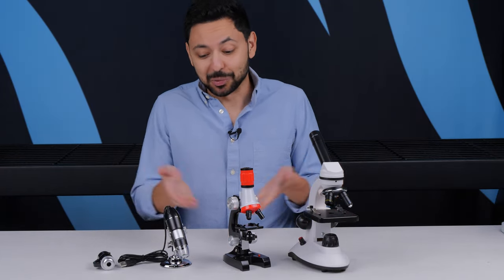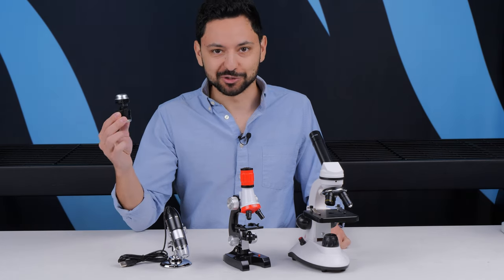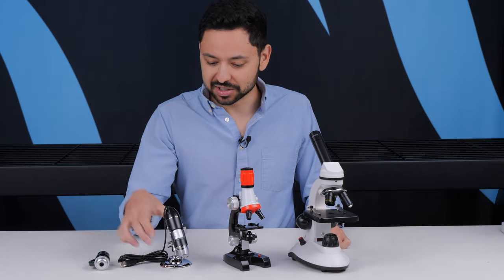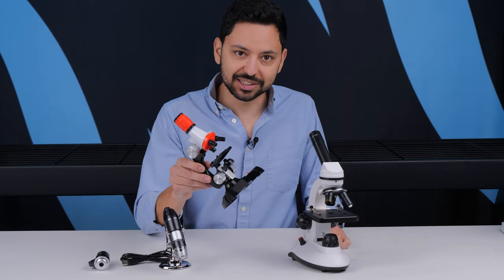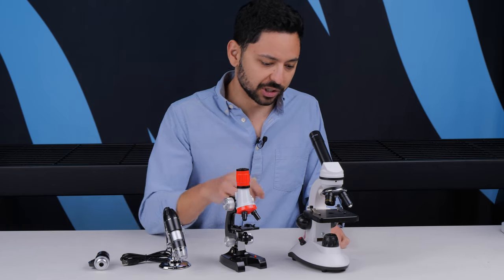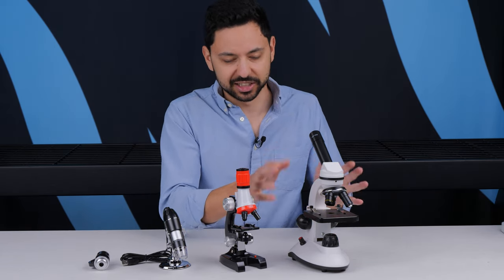Do cheap microscopes actually work? I have a bunch of cheap microscopes in front of me: a smartphone microscope coming in at about $20, a USB microscope at a little over $20, a kids compound microscope at slightly under $20, and an upgraded compound microscope at about $50 to $60.